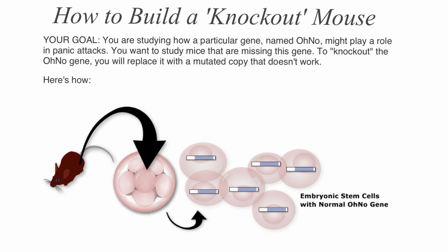Of course, we cannot do it with humans, so we use mice as a model organism. Mice have almost all 23,000 genes which are homologous to humans. So we knock out such a gene and we see what changed in the organism of the mice, how the mice change phenotypically, what effect such deletion of the gene has on the health of the mice. So later we can say that probably in the human organism we are going to see the same result.